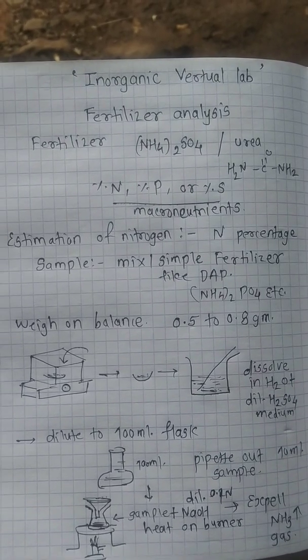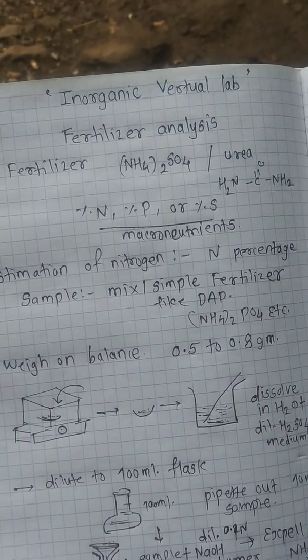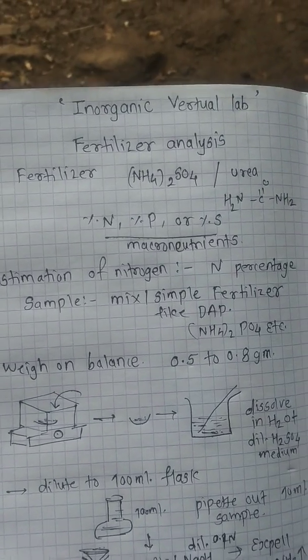Estimation of nitrogen is performed for fertilizer analysis. The percentage of nitrogen is determined from the sample of fertilizers, mix or simple fertilizers like DAP or ammonium sulfate or urea.